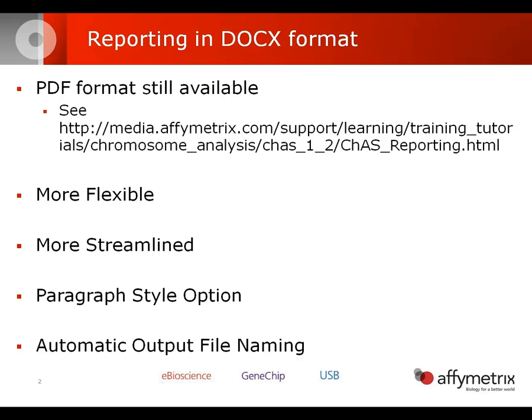The docs format allows the export to be more flexible, so I can export multiple graphs and tables at the same time, as well as it makes it easier for cutting and pasting of this information into your organization's templates. The reporting out in this new docs format is also more streamlined, as it allows for a paragraph style option for the segments table, and we'll walk through that, as well as little things like automatic output file naming.